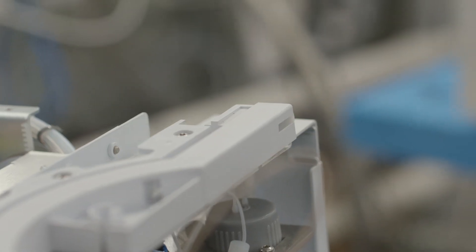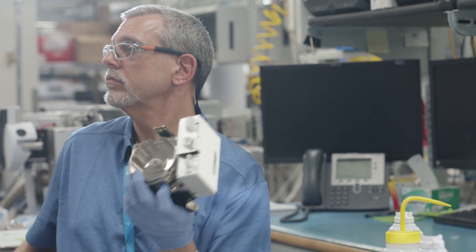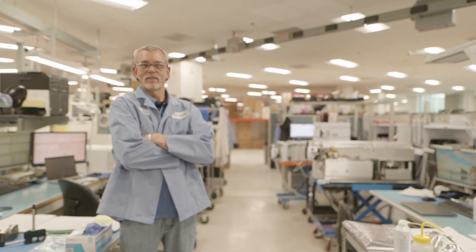People are relying on the instrument to give them the answers that they need and work correctly, so I do take a lot of pride in it. Quality has to be number one. I feel that our instruments are top quality. I'm building the instrument as though I'm buying it myself.